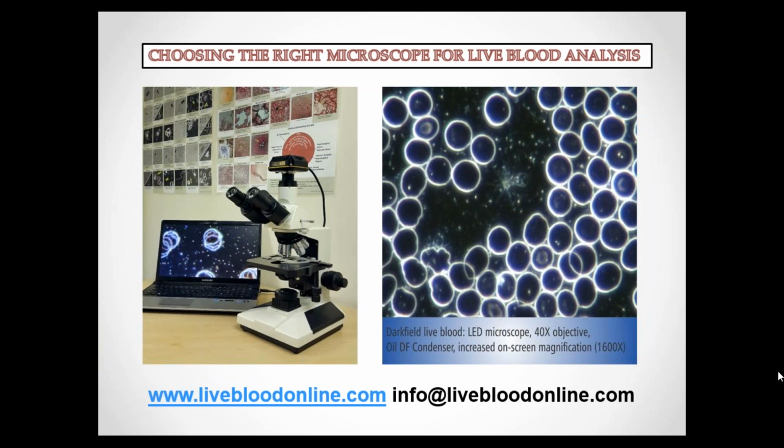Oh, I see. So in classic hematology, they tend to stain instead. Why don't they use light field and bright field and dark field?